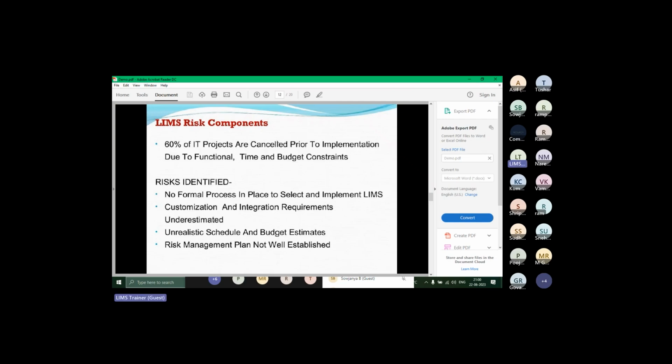Budget is one thing, time is one thing, but sometimes you see that your implementation strategy or the data is an issue. Maybe you used an older LIMS and now you want to migrate everything to another LIMS technology, from X LIMS to YZ LIMS. But migrating from one LIMS to another can have a lot of challenges. Maybe it's taking more time than you estimated. That LIMS had a different table structure, and here it's a different table structure, so you need to do the mapping and everything.